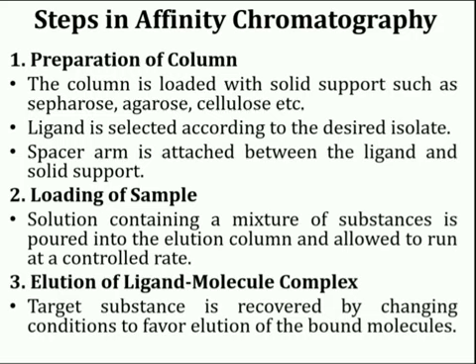Next are steps in affinity chromatography. First is preparation of column. The column is loaded with solid supports such as sepharose, agarose, cellulose, etc. After this affinity medium is equilibrated by using binding buffer, the ligand is selected according to the desired isolate and spacer arm is attached between the ligand and solid support.